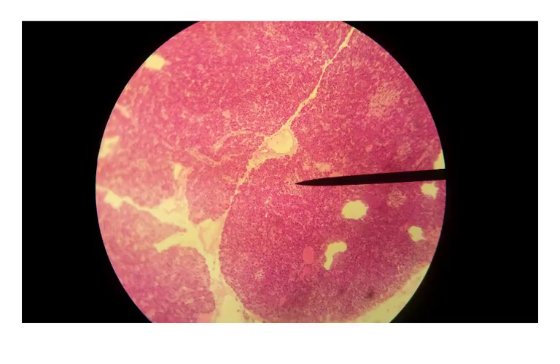Okay, so now we've moved to the next slide. This is the pancreas. And this is kind of a weird organ. It's an endocrine organ, but it's also a digestive organ or an exocrine gland. So all of the other endocrine cells that we're looking at are going to be just endocrine in function. But the pancreas is actually endocrine and exocrine both. There's going to be a couple of different structures on here that you'll need to know. These kind of open, mostly white areas, these are pancreatic ducts.